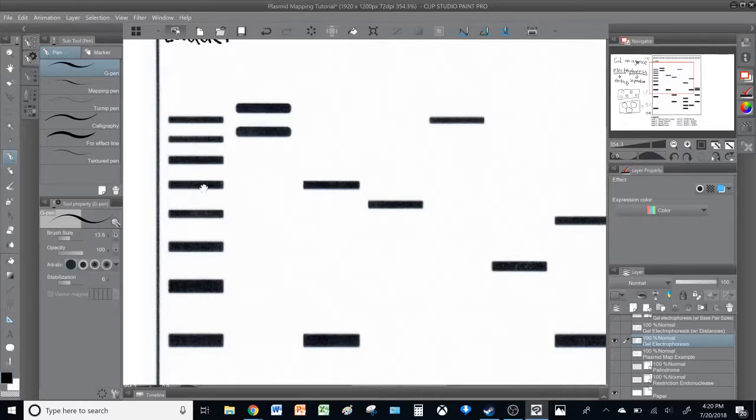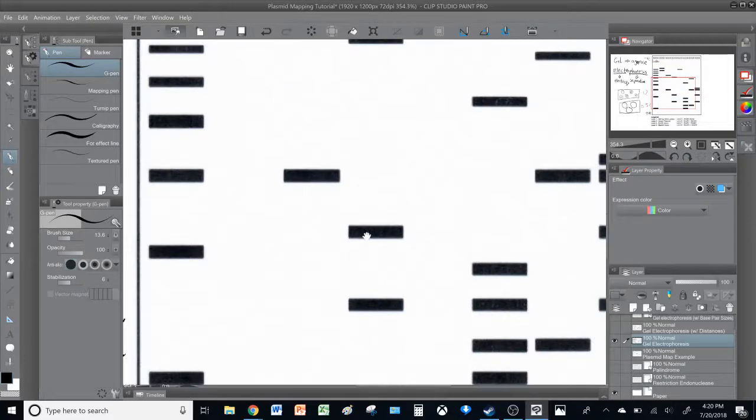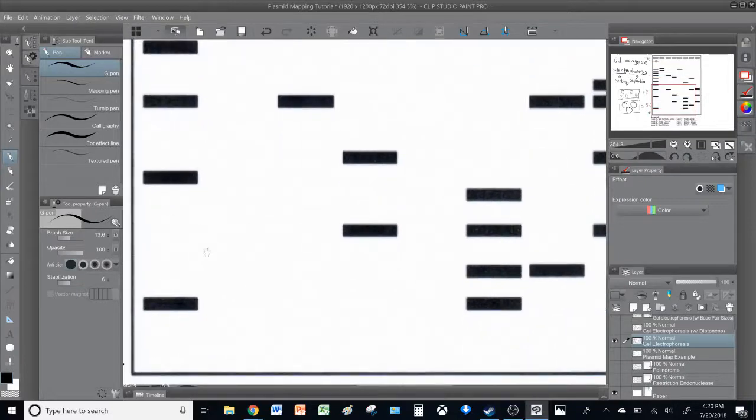For example, if you want to know how big this band is, you simply compare it to your ruler. So if this is 4.5, this is 3,500 base pairs. Since this is at the same level, this automatically becomes 3,500 base pairs. The problem lies with the base pairs that lie between two increments like this. So this is 1,000, this is 500.